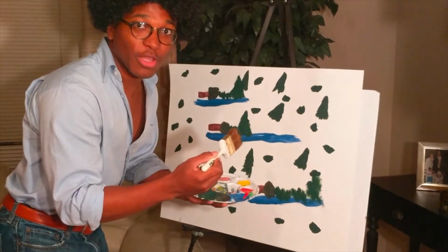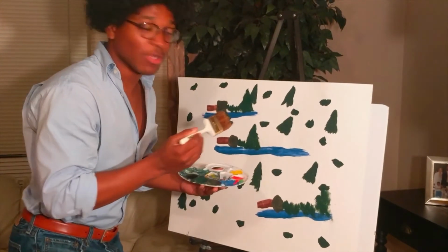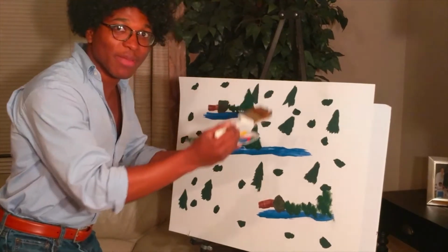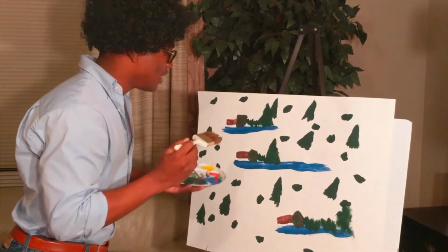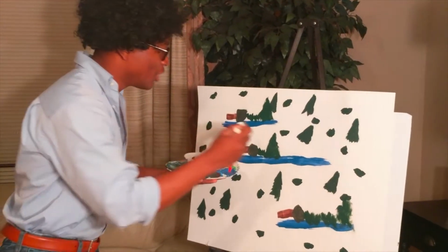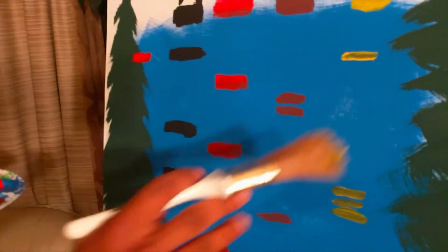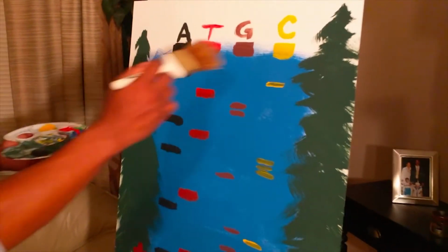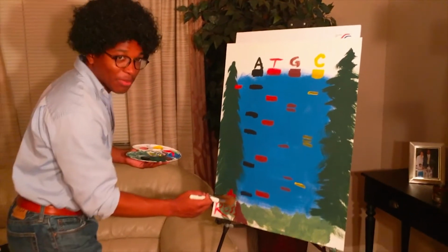And when we mix these in with all the other 4 tubes, that means we'll have every single nucleotide sequence there. As we run it through the electrophoresis side by side, we'll know where every single nucleotide is. So now to set up the electrophoresis, we're just going to do a couple finishing touches here. Alright, with our finishing touches, we see the complete electrophoresis. We got all the wells divided by size, larger at the top, smaller at the bottom to the positive end.